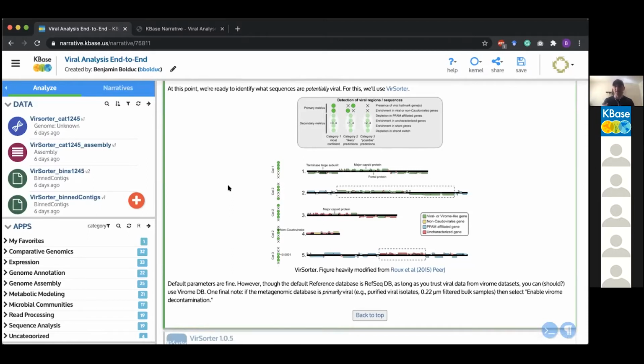What these categories are basically is what looks like a virus. So for example, does this sequence have viral hallmark genes? Not all viruses have a single marker gene. Curse you 16S genes, people who use that for taxonomy, you're cheating. So viruses don't have this hallmark gene, but they do have genes that are common among certain groups. And if you have a sequence that has some of these genes that aren't found in microbes, you can use them in order to identify these viruses.